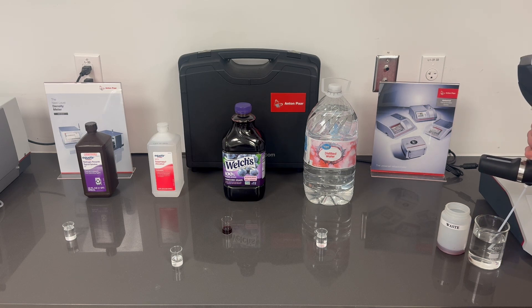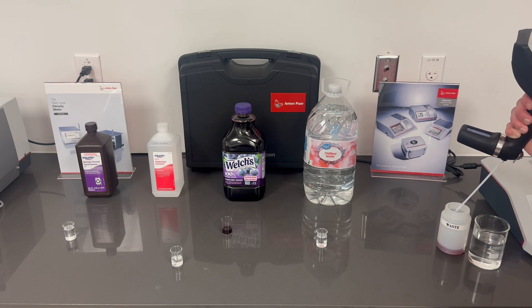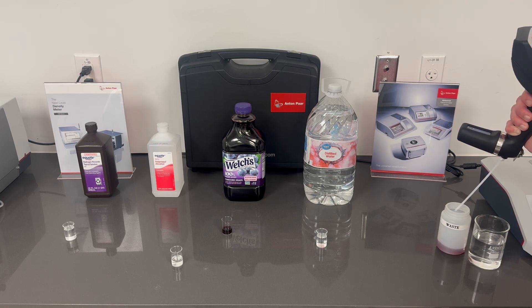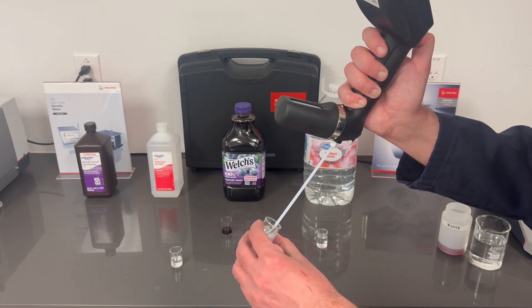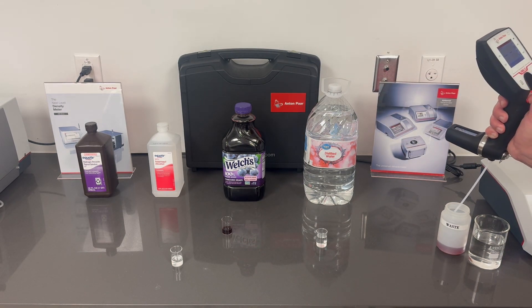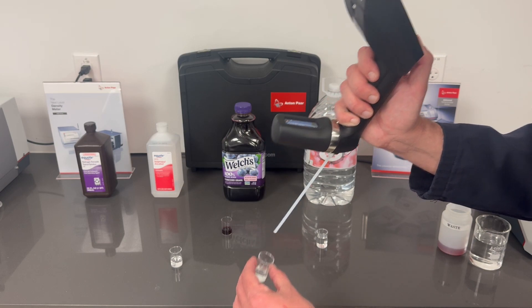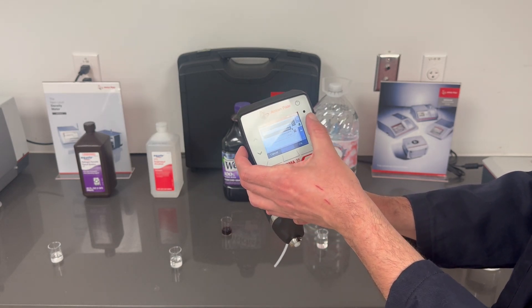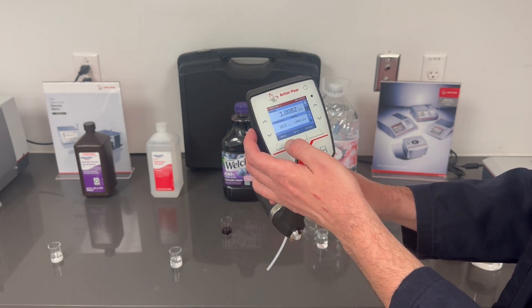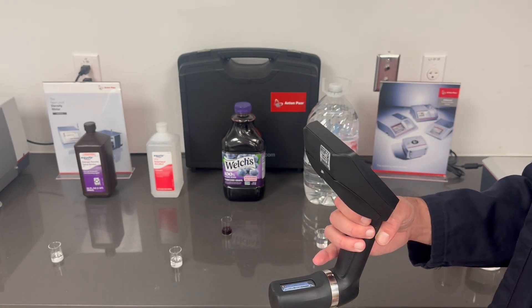Now we're going to move on to hydrogen peroxide. Go ahead and rinse our DMA out so that the measuring cell is nice and clean — four or five rinses should do it. Draw number one and number two. We'll switch our sample method to hydrogen peroxide. The DMA is saying 3%, and the bottle is 3% — right on point.